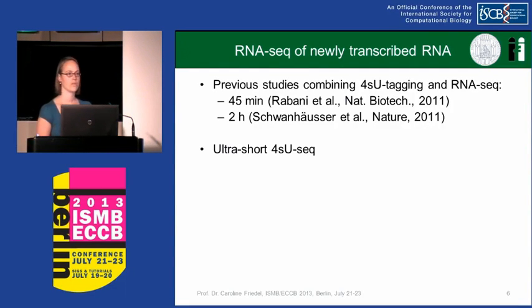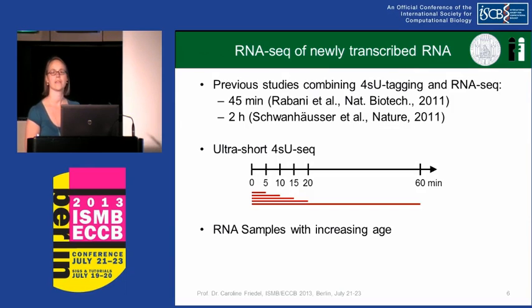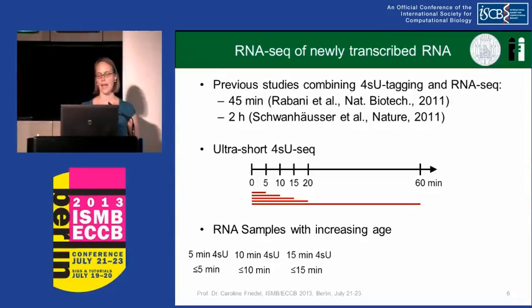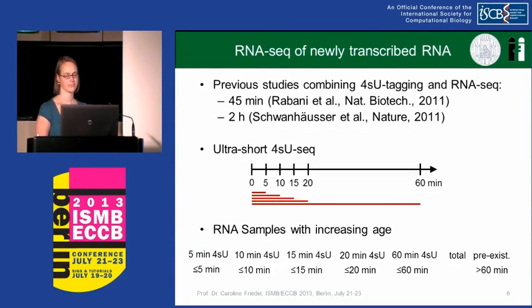What we did is we used ultra-short RNA tagging. We labeled for the first 5 minutes, the first 10 minutes, 15 minutes, 20 minutes, and then 60 minutes. We also extracted total RNA and the pre-existing RNA at 60 minutes. So what we get is RNA samples with increasing age of RNA. In the 5-minute 4sU sample, the RNA is at most 5 minutes old. In the 10-minute 4sU sample, it's at most 10 minutes old, and so on. In the total RNA sample, you have all the RNA in the cell, and the pre-existing or untagged sample gives you the old RNA, which is at least 60 minutes old.